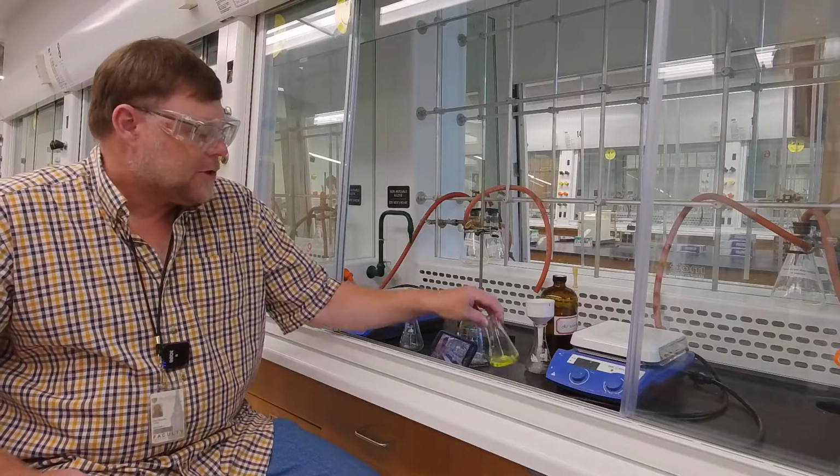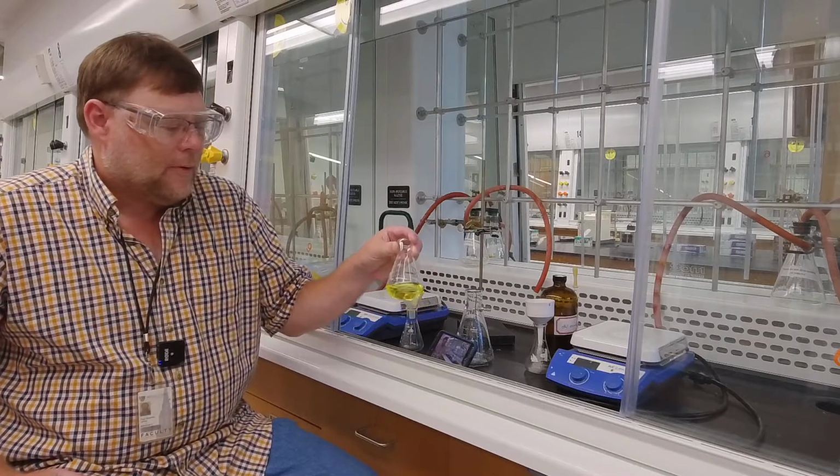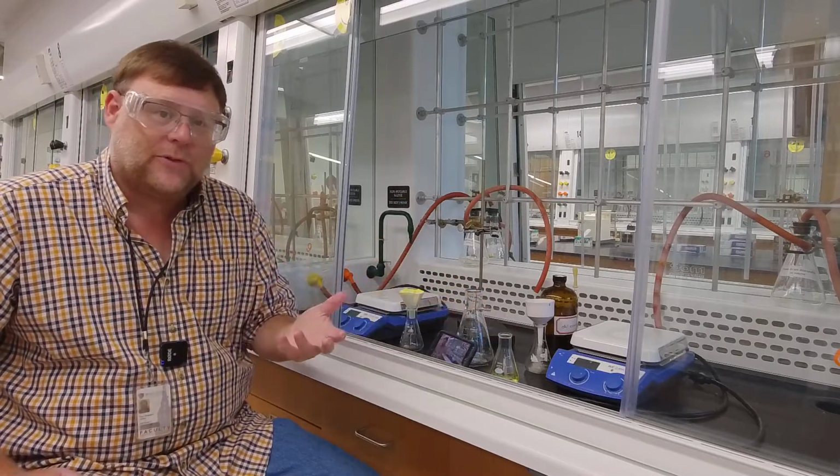In this video, I'm going to show you how to use a rotary evaporator, or a rotovap, to remove a volatile solvent from a solution and leave behind whatever is dissolved.